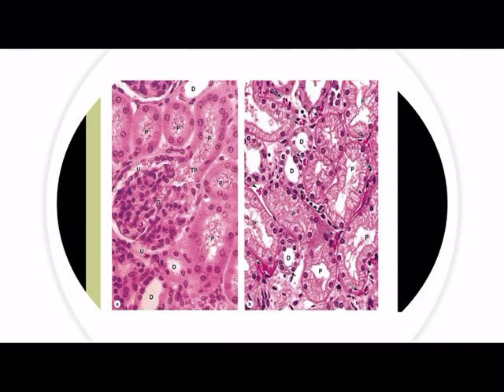So this is a microscopic illustration of your tubules. Always remember that the one that nears or envelopes your glomerulus would be your proximal tubule. So here this is clear. You have here your glomerulus, then you have your tubular pole. The proximal tubule doesn't have a clear lumen because it always looks dirty inside, and that's your proximal tubule.